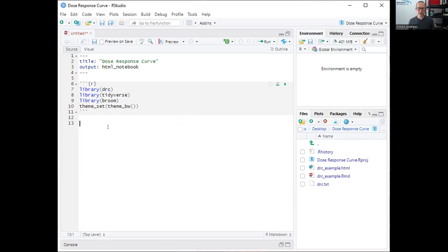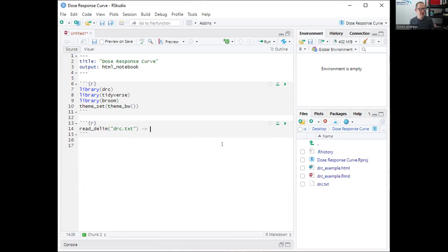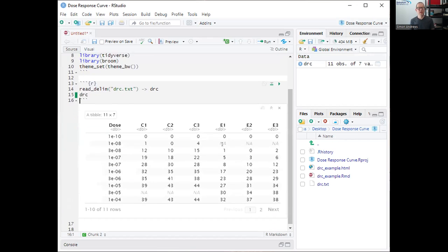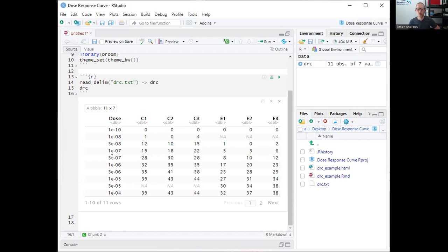We need some data to work with. I've prepared an example data set — a tab-delimited text file — which I'm going to read in and save into a variable called DRC. This is the typical structure of data you'd get from a dose-response curve experiment. We have a set of different doses as serial dilutions — logarithmically spaced: 1×10⁻⁴, 10⁻⁵, 10⁻⁶, 10⁻⁷, 10⁻⁸, 10⁻¹⁰, with some intermediate values over a very wide range of concentrations.